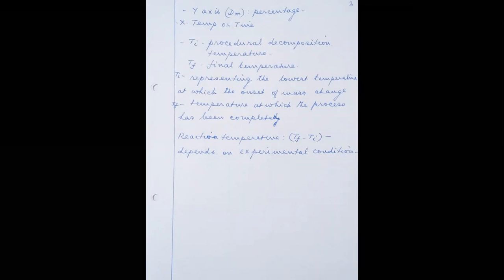Normally, transition temperature does not change with the quantity of the substance. Even if you take a small quantity or a big quantity, the transition temperature is going to remain the same. It is an intensive thermodynamic property. But certain other things will change with the mass also.